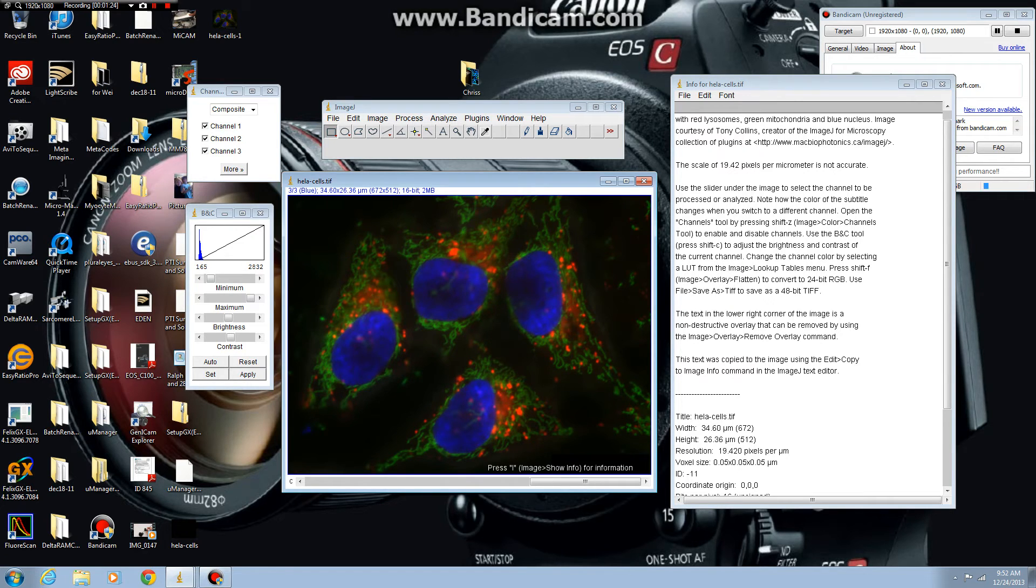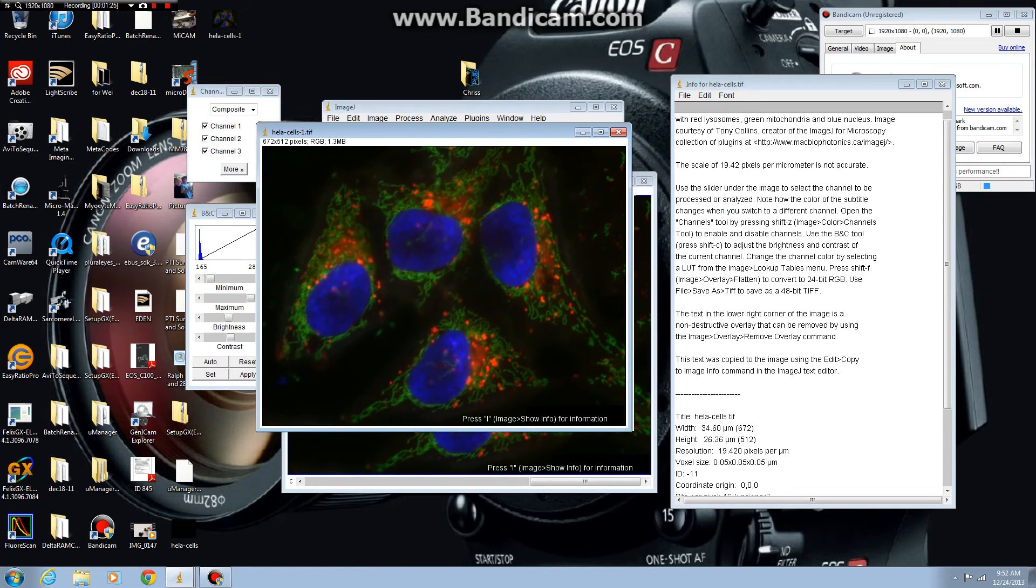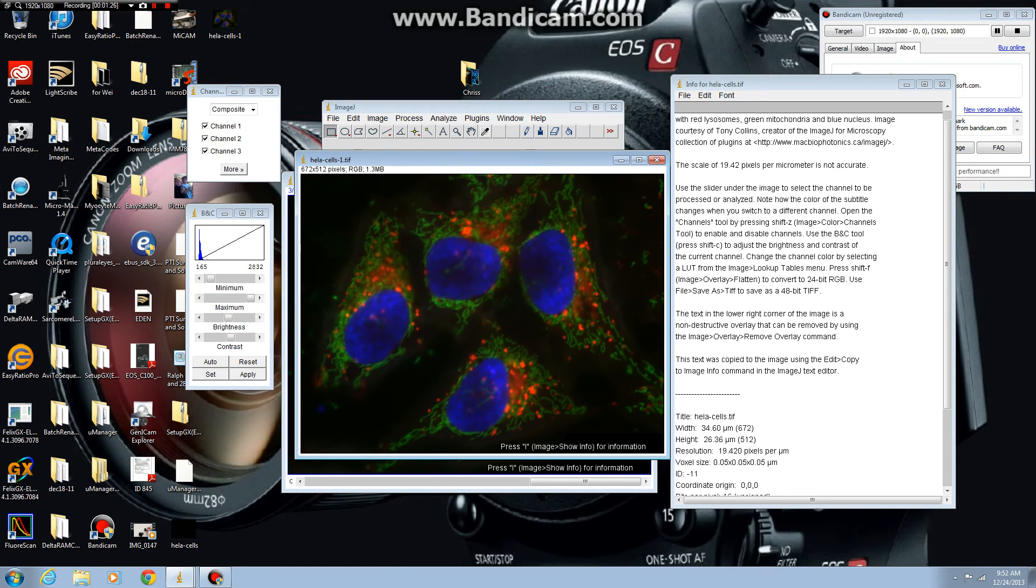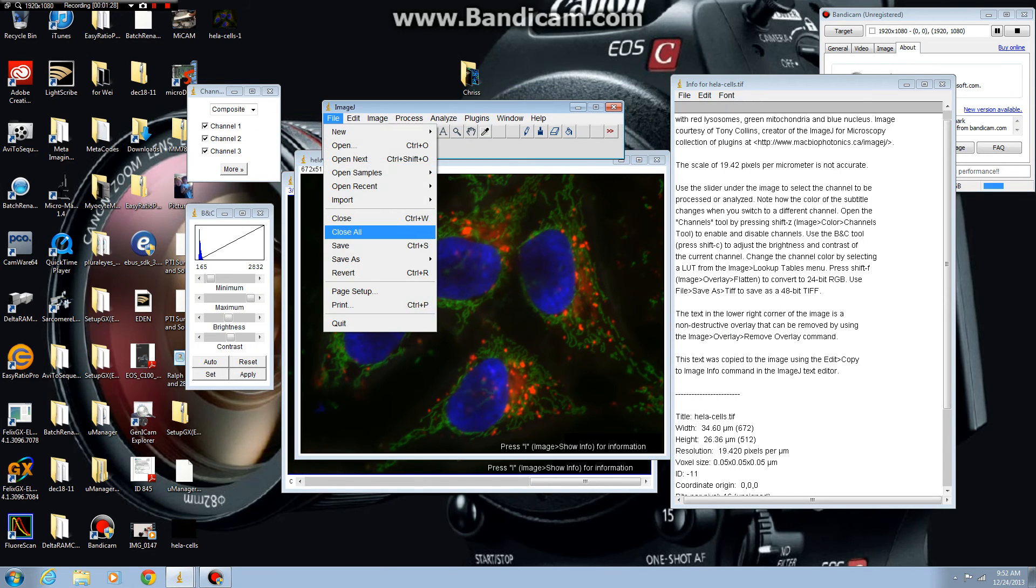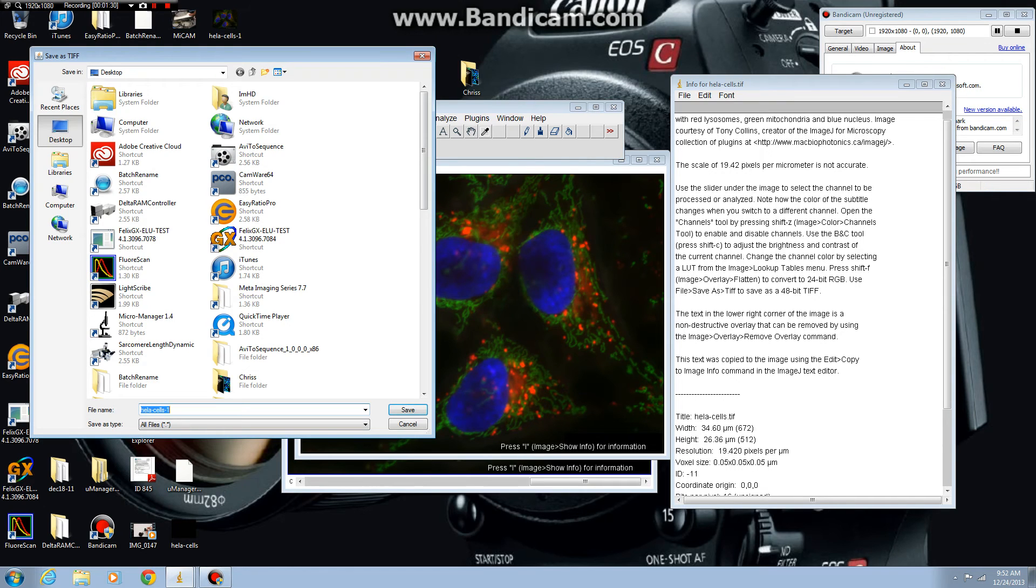Shift-F creates a new image. From this image window, select File, Save as TIFF. We'll save it to the desktop as HeLaCells1.